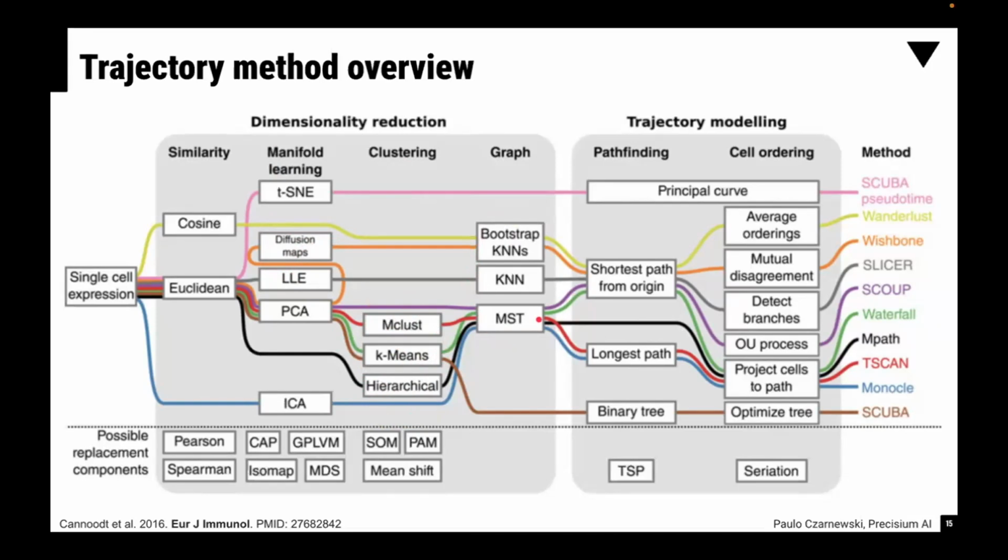For example, which subclusters are connected to each other or are close to each other in space, and that's primarily done via what is called the MST, minimum spanning tree, which is my next slide, where I'll explain that part. From that, you can then try to identify which cluster is your stem cell.